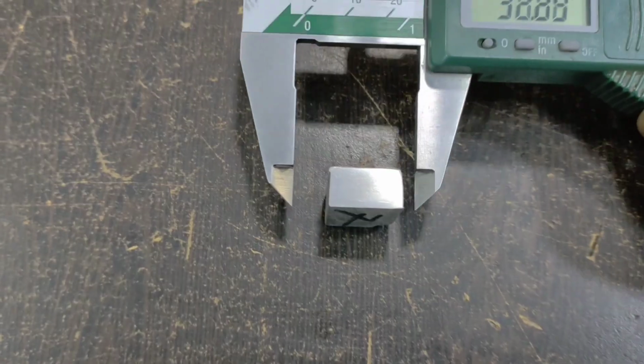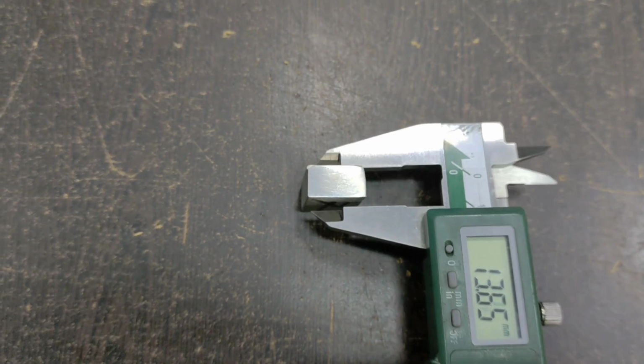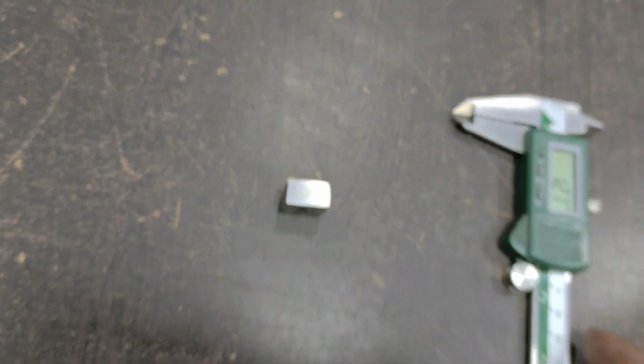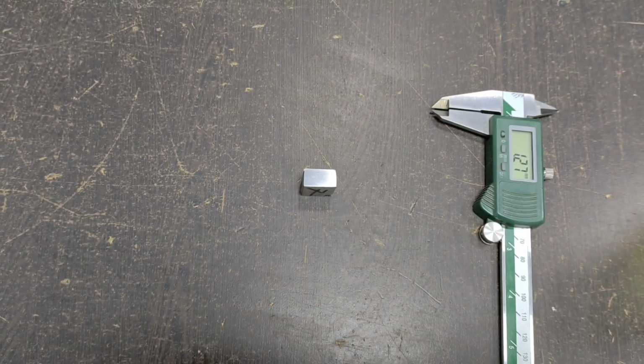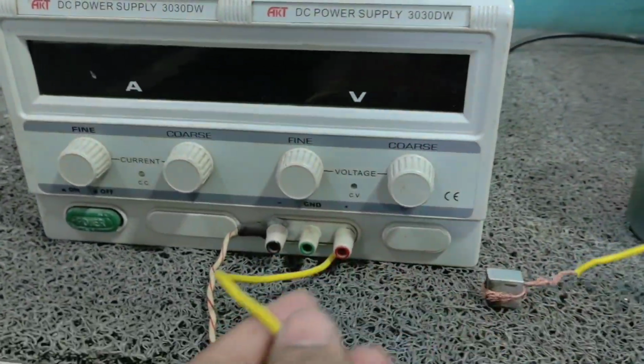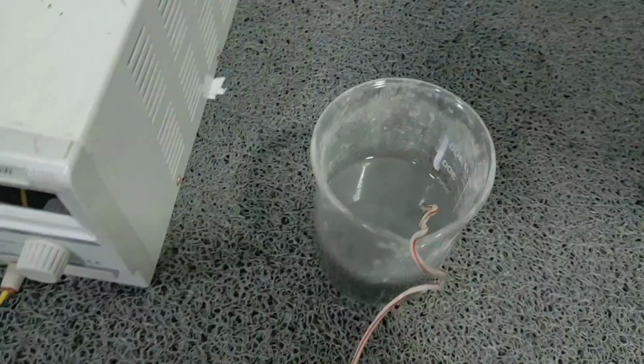Take the specimen and mirror polish. Measure the total immersed area of the specimen to be etched in square centimeters. Connect specimen as anode and etch at 1 ampere per square centimeter for 1.5 minutes. Rinse the specimen thoroughly in hot water and then in acetone or alcohol.